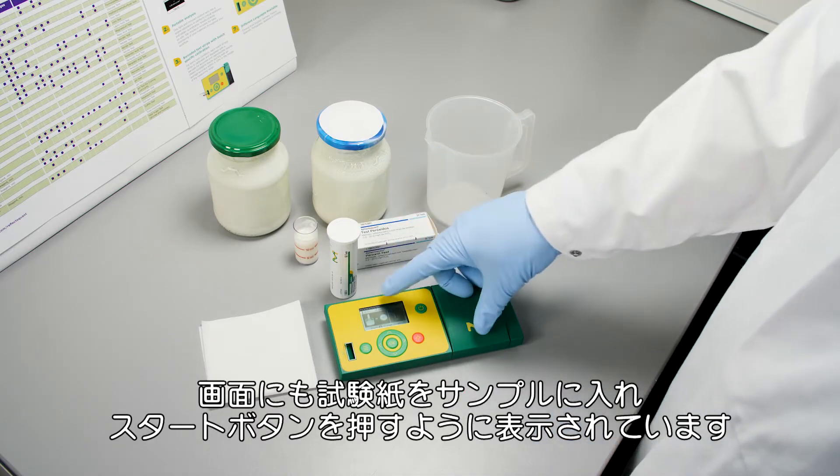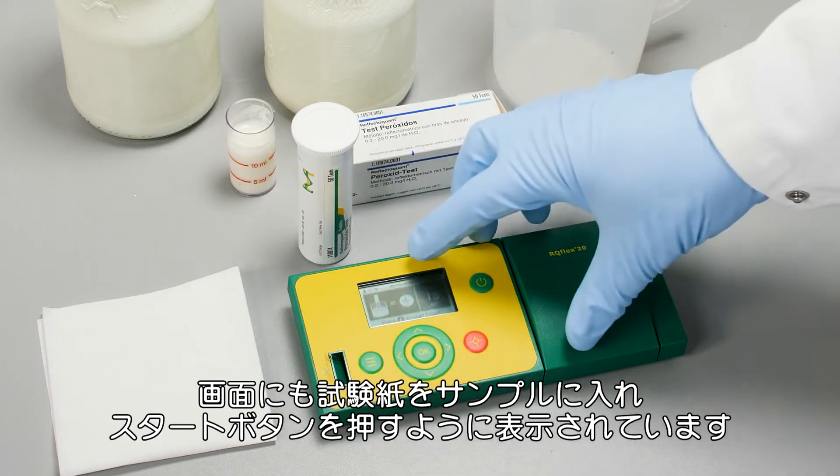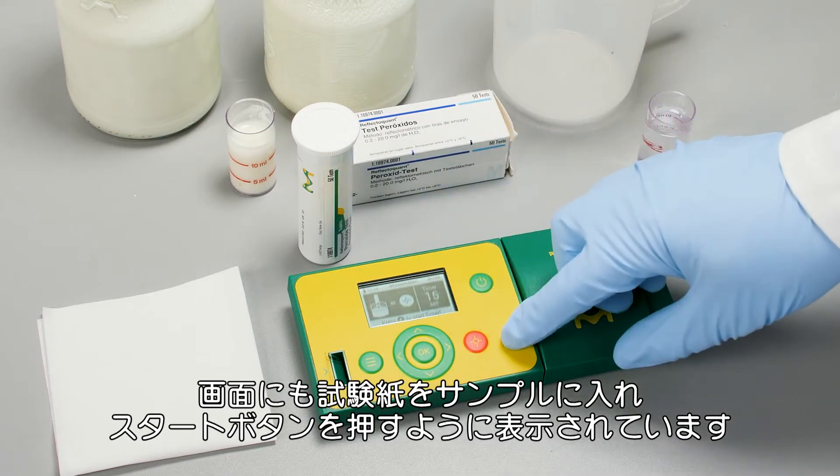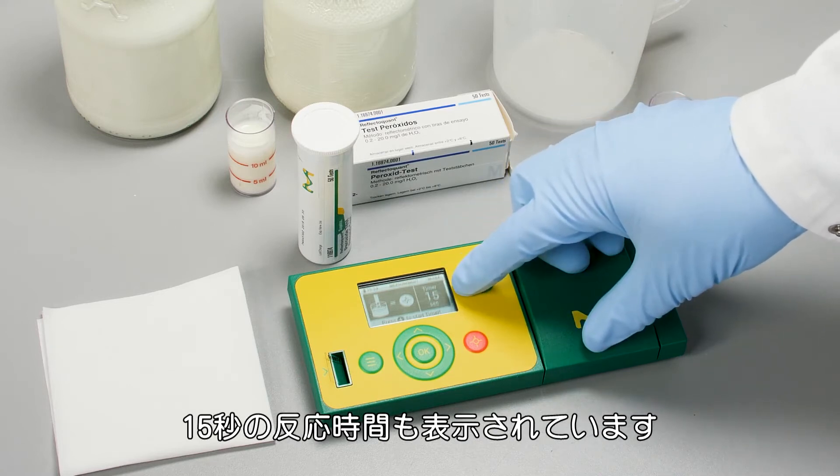You can also see here on the display that it shows you have to stick the test strip into the sample and press the start button at the same time. You can also see the reaction time — the timer is 15 seconds.